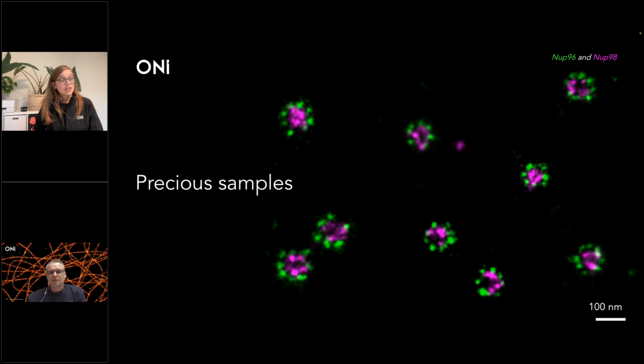And then we have another question from the audience, regarding imaging and labeling. How can we enhance localization precision, particularly when dealing with sparse labeling in limited sample quantities? Okay, so your localization precision will depend on your fluorophore, and that's affected by the laser power and the exposure time. So it's all dependent on signal to noise ratio, and that's independent of the structure you are looking for, because you are actually imaging the dye.